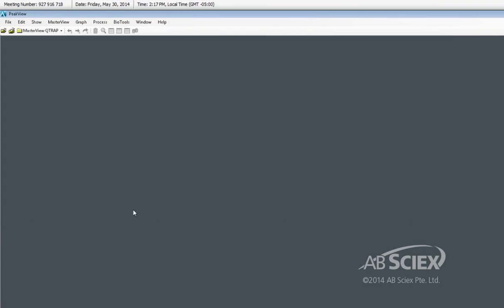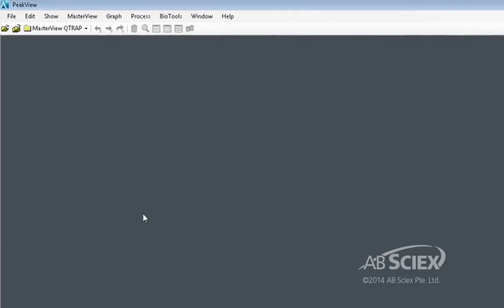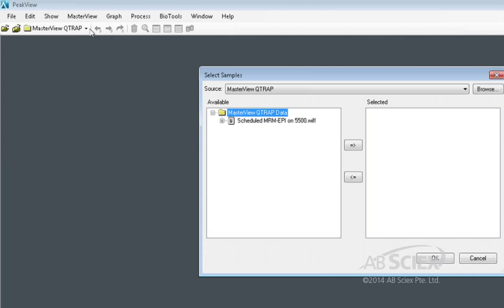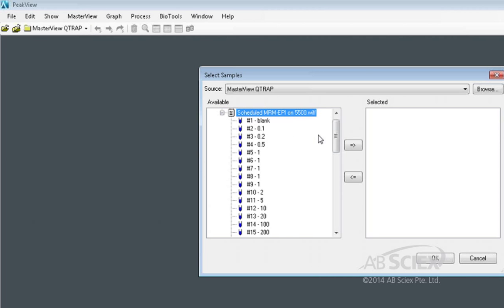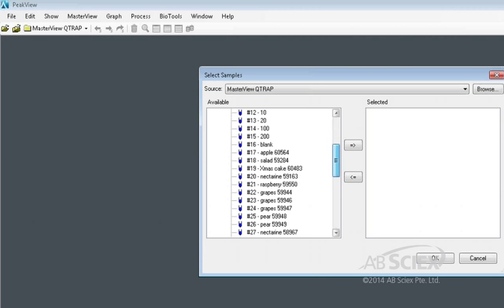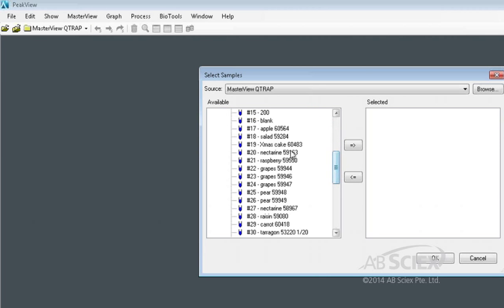From the PeakView software interface, we select MasterView, New Session. From here, we import the data files that we want to process against our compound library. In this case, we will select 13 of the food samples we analyzed in this batch.